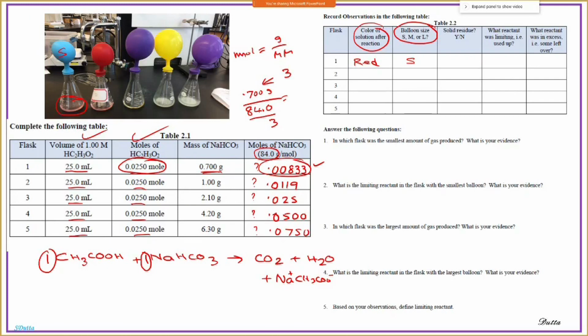Do you see any solid left? Any residue left? Yes or no? No. What reactant is the limiting? Then you need to compare these two numbers. So what is the definition of limiting? Limiting reactant is the reactant that runs out first.